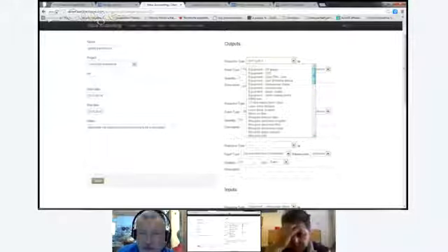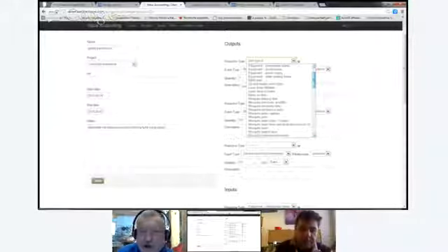Sometimes the output will be a document saying, okay, here's what we learned from this experiment, and then that document can be the input to other design processes or something like that.